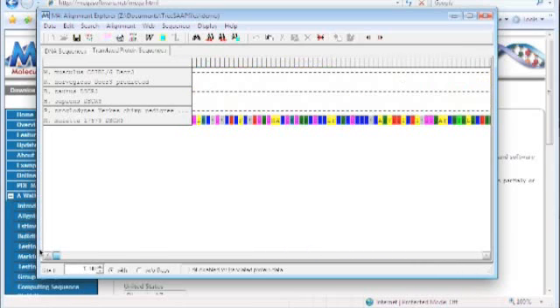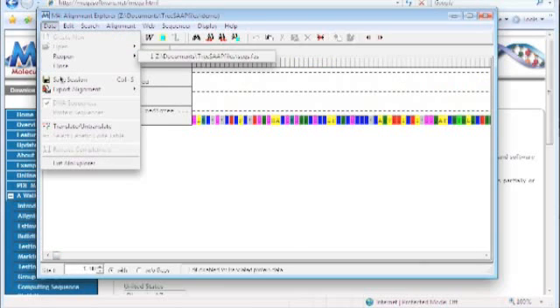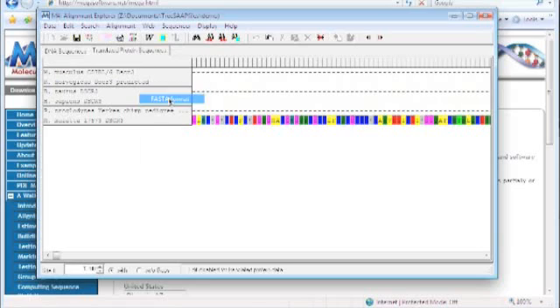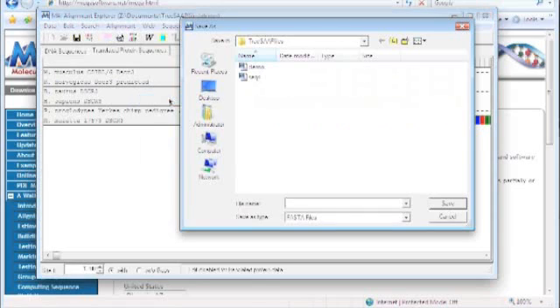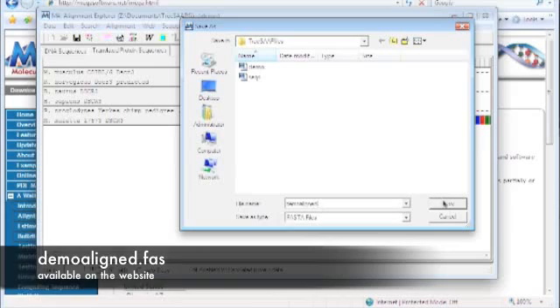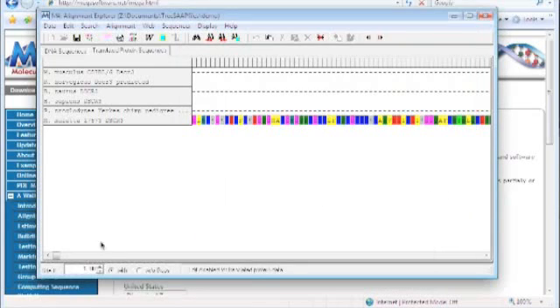Alright, so that's how you do an alignment. We're just going to save this out — this is going to be important in our TreeSap analysis, so we're going to export it as a FASTA format. And I'm just going to call this 'demo align.' I'll put this on the website also.